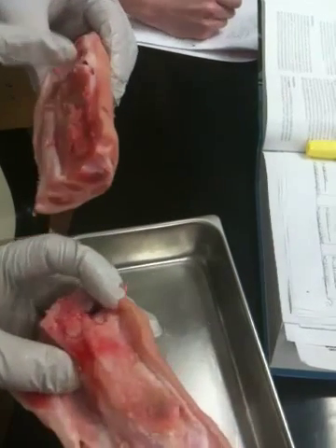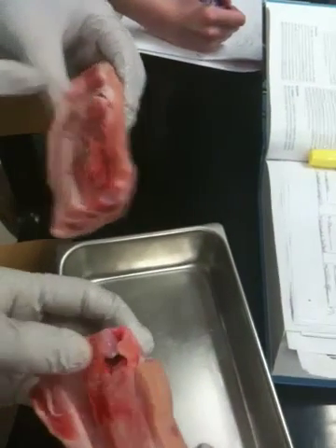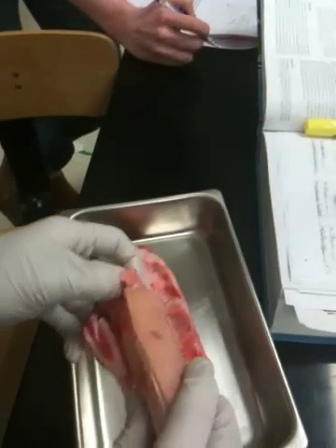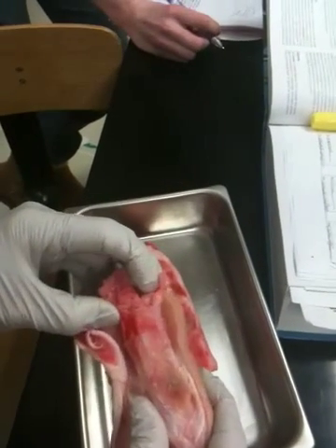The end — the epiphyses. Every bone has its ends, so every bone has a proximal and a distal epiphysis, and then the main portion, which is the diaphysis.